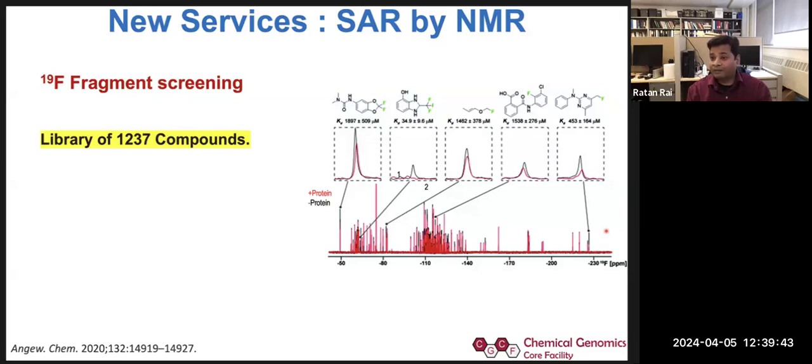But definitely it helps, because it will give you some kind of binding pocket where it binds, and even if we find a hit over here, we definitely go back and see in silico modeling how it works, because these are small fragments, these are not drugs. So the idea is, if we find one pocket, we try to see where it binds, and we have some kind of modeling over there. Suppose your protein structure is not solved through NMR, and it has a cryo-EM or X-ray structure. Then in that case, in silico modeling is really important, because there will be no other way to look at where it binds.